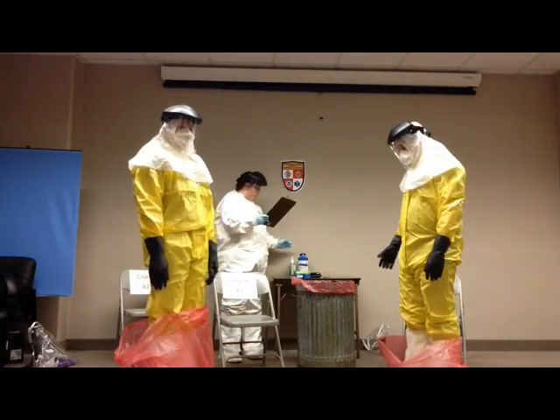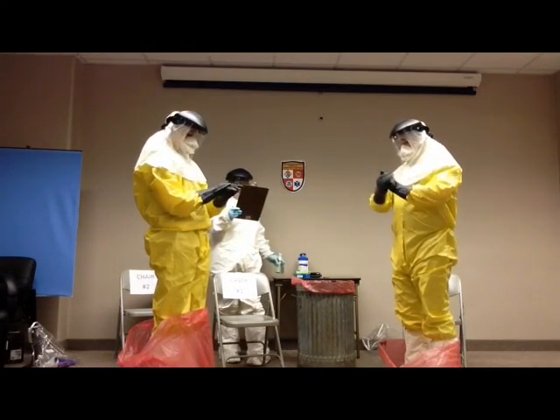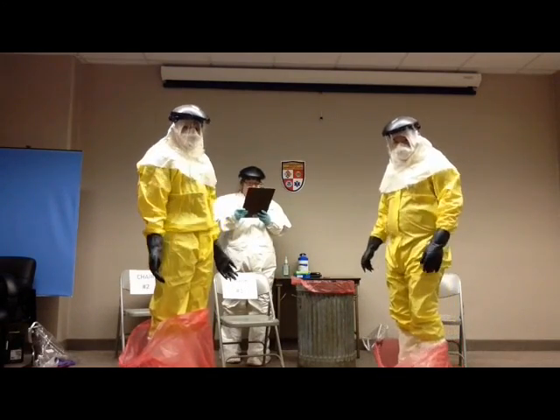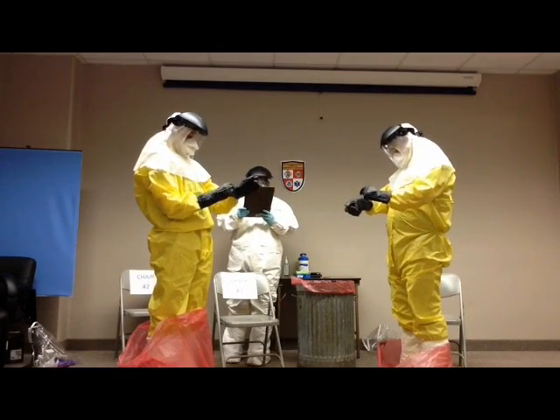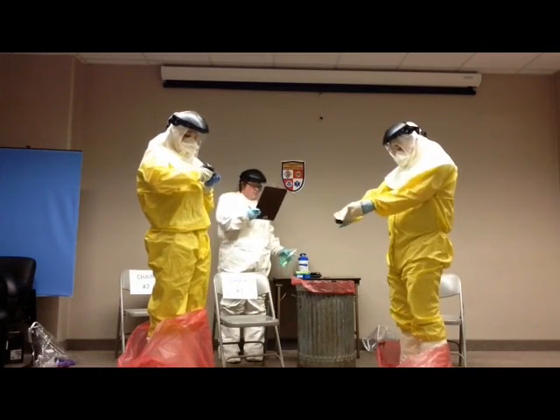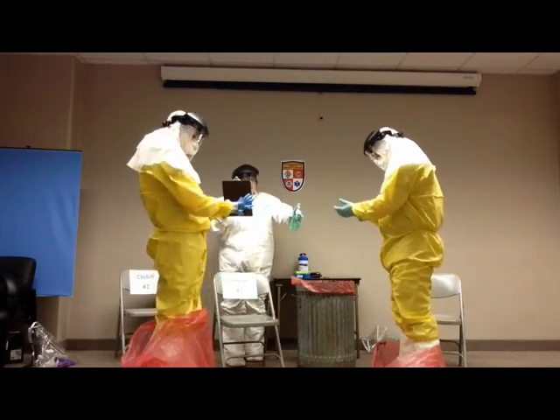Disinfect outer gloves with disinfectant wipe or alcohol-based hand sanitizer. Rub hands together for 20 to 30 seconds and allow to completely dry. Remove outer pair of gloves using glove and glove technique and discard properly. Inspect and disinfect inner gloves.